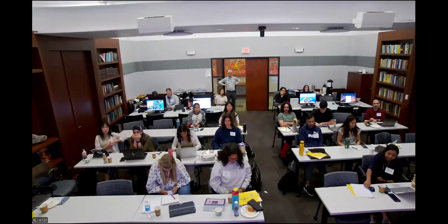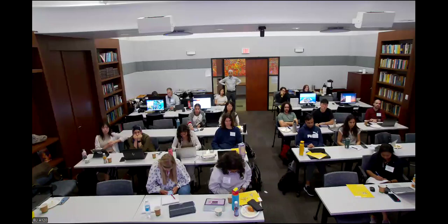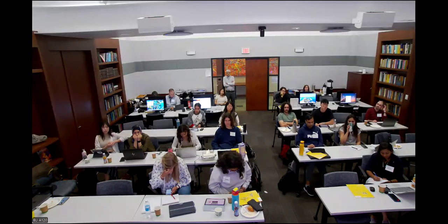Yeah, excellent question. Optical clearing is extremely popular. People use it for all kinds of things, including coherent Raman, second harmonic generation, fluorescence. This is something people have done quite successfully because it really addresses an important limitation. You reduce the scattering, you can go deeper, right? It is not something you can apply all the time because it's really hard to do it in living specimens, especially in humans, right? But certainly ex vivo, it is a great way to do it. In some animal models, you can also apply it within certain limits. So it is one way to go around this problem of tissue scattering.